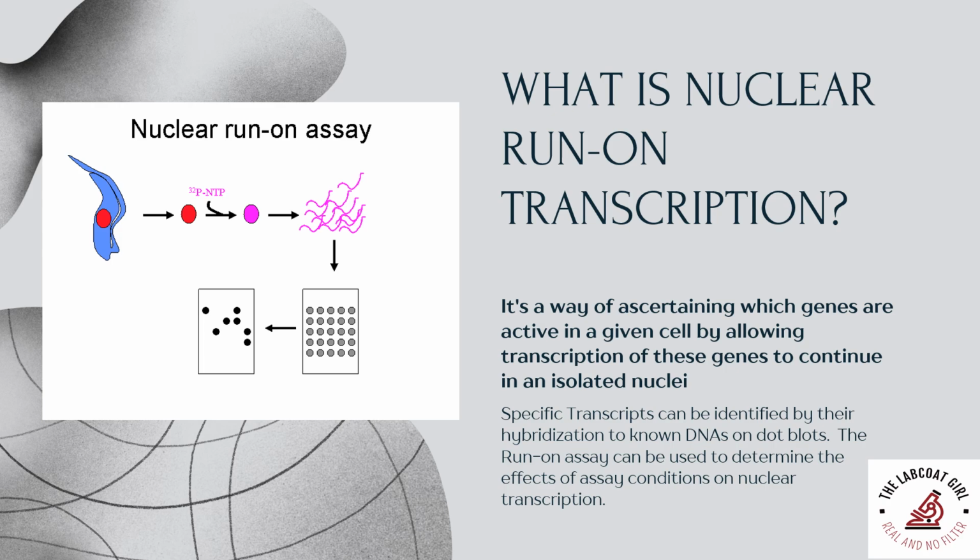Now how are we going to do that? And if you have already allowed it, how will you find out which strand was developed in vivo and which strand was developed in vitro? Since we are performing everything now in vitro, we will use a labeled nucleotide. With that help, it will act as a marker for you to find out. I hope this is very easy to understand.